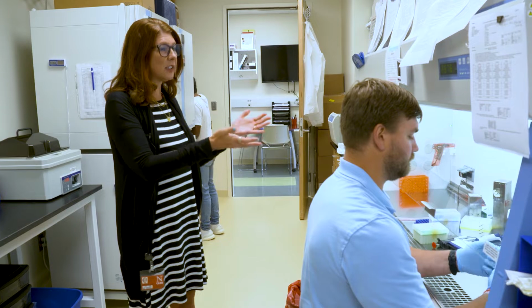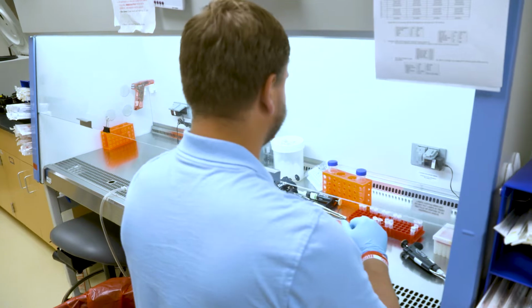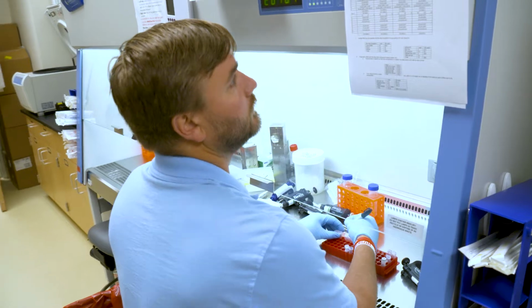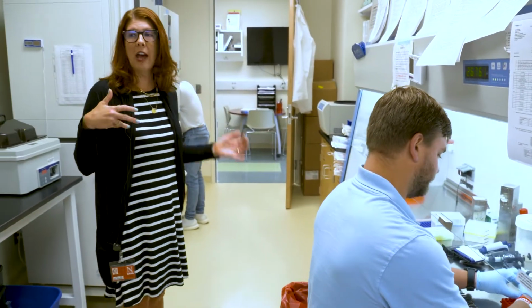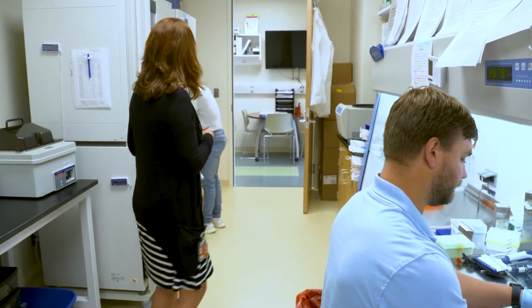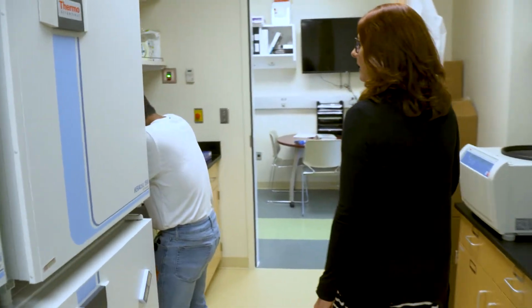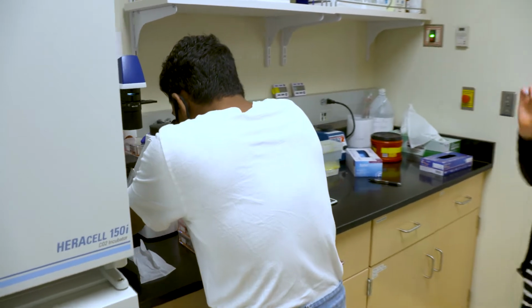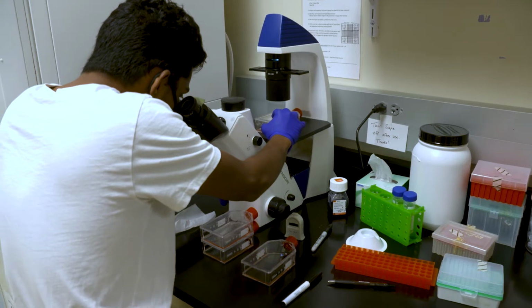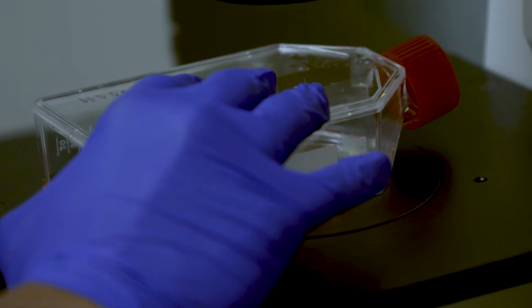So this is where we can sterilely handle human cells and manipulate those cells and experiment with those cells to determine if our nanoparticles that we are developing are able to actually deliver genes into those cells. And so we actually have the capability of having 4 students performing cell culture in here at the same time. And we also have the capacity to have large incubator spaces and a small imaging facility here, where we're looking at stem cells derived from human fat that are growing and attached to the bottom of that flask.